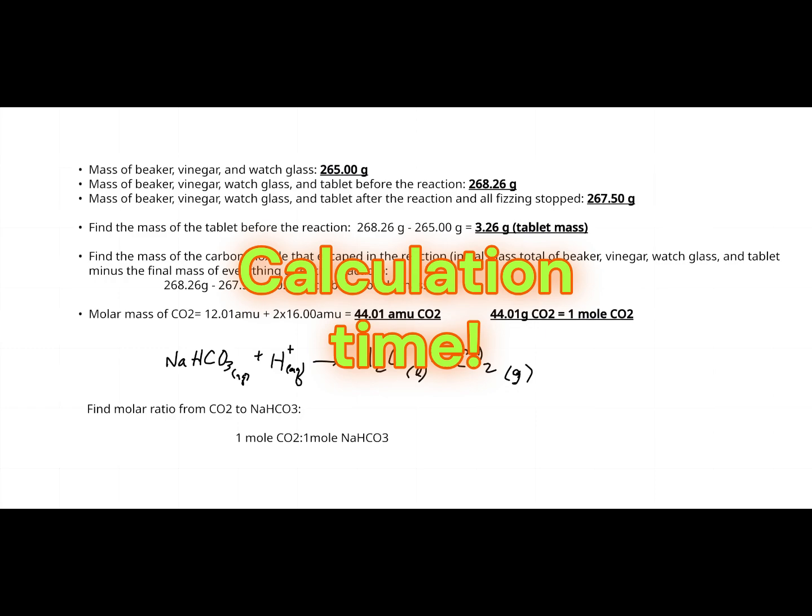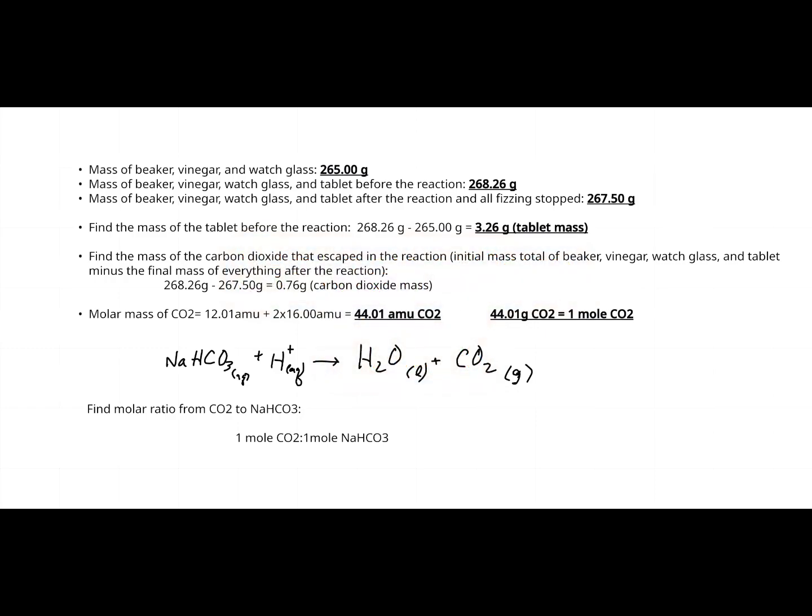On with the bulk of the lab, and we're going to go to the calculations now. You can see the sample calculations of the person who did 7-3 in the book and what they wrote down for the masses for what they got when they did the experiment, and kind of follow along that process. But I'm going to go ahead and do it here on the whiteboard so that you can see the amounts we got and the calculations that we will do together.